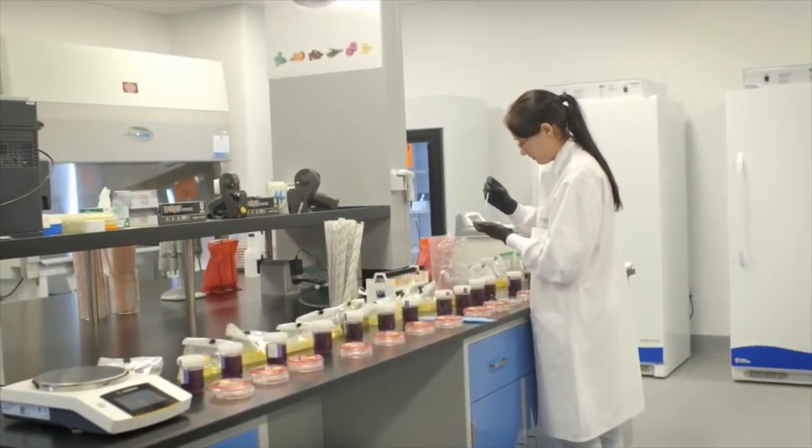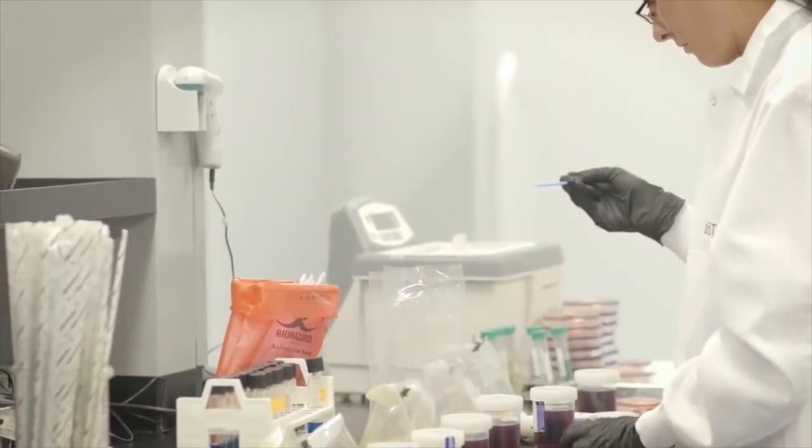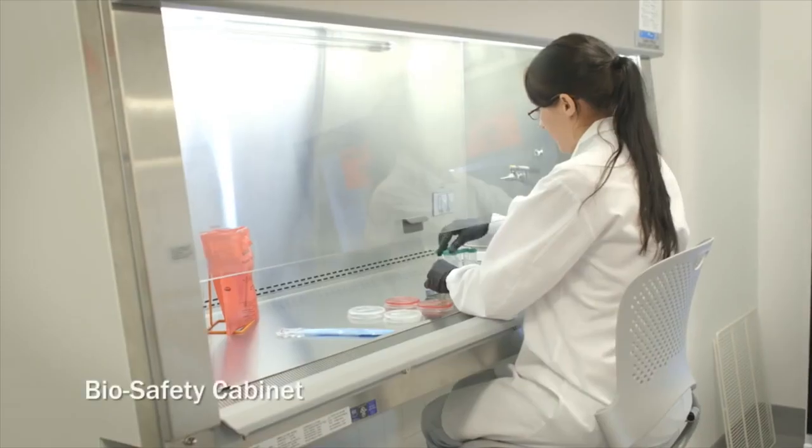Part of our contamination testing on essential oils is that each one will go through a variety of microbiology tests. In the micro lab, we test for total plate count, yeast and mold, salmonella, E. coli, and Pseudomonas.